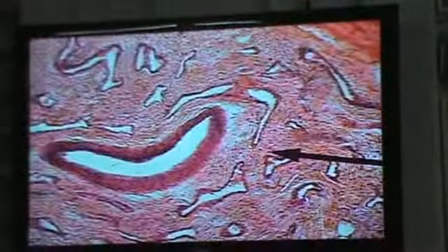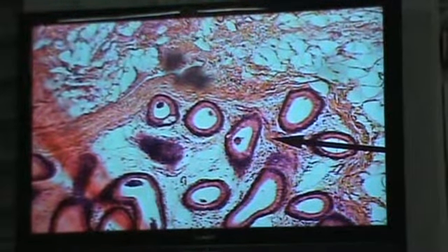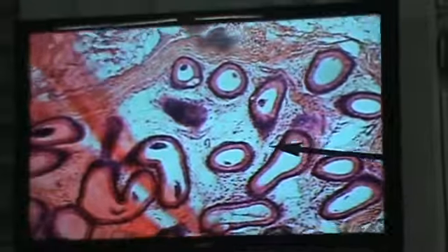We're going to do the slides of the penis, etc. for the next lab. We see another slide showing a better preservation in the rete testis. Okay? As I say, from there we lead into a structure known as the what? The ductuli efferentes. Now, one of these slides I think has some ductuli efferentes.